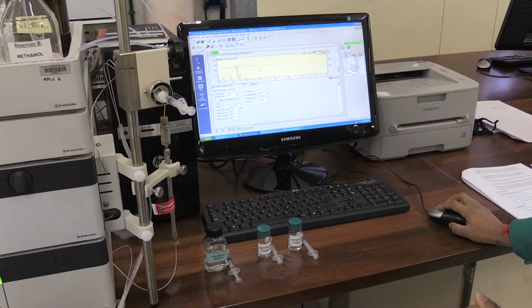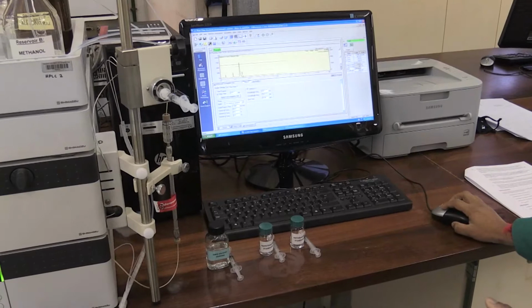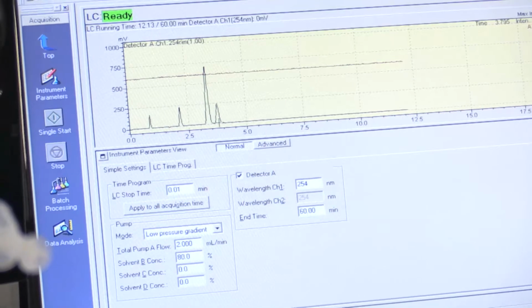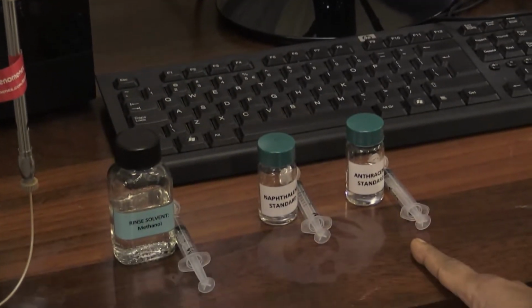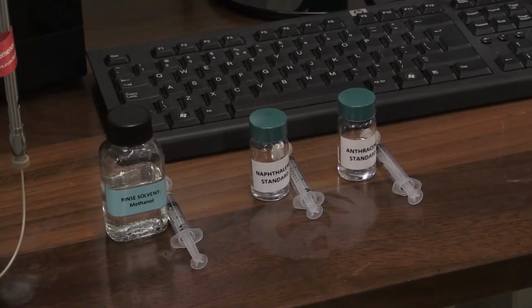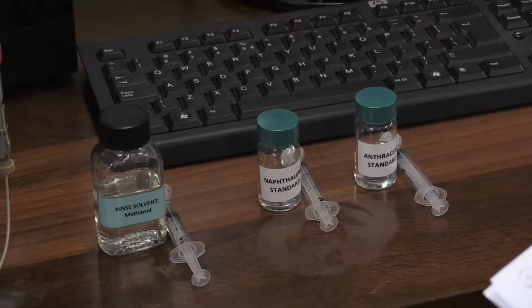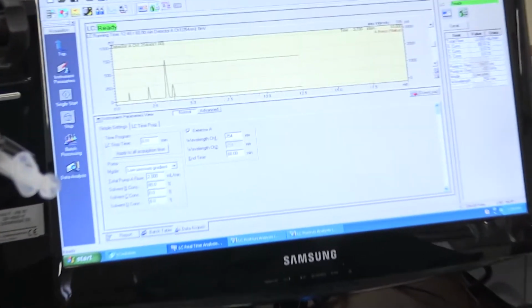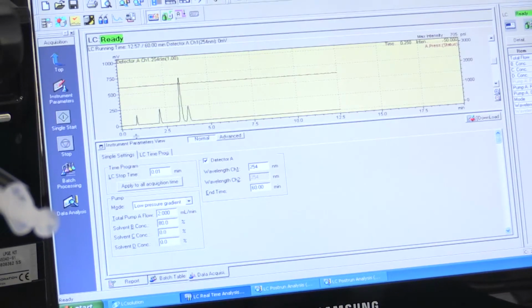We are now ready to identify the 4 peaks. We have provided 2 pure standards, naphthalene and anthracene, and our prac manual discussion has shown us that resorcinol has been added to this mixture as a non-retained compound, which tells us that resorcinol is peak number 1, so there is no need to inject that compound on its own.